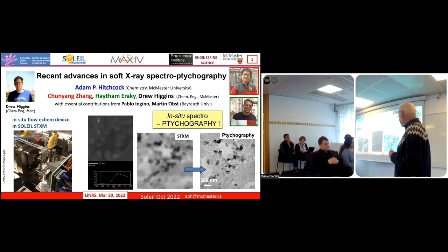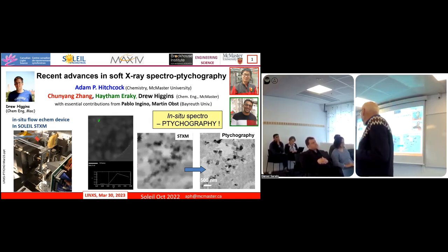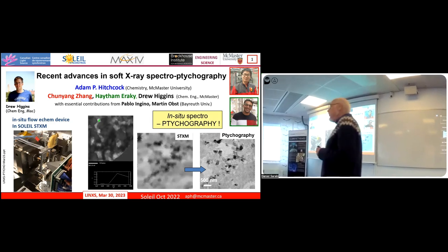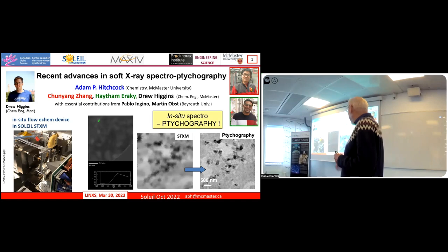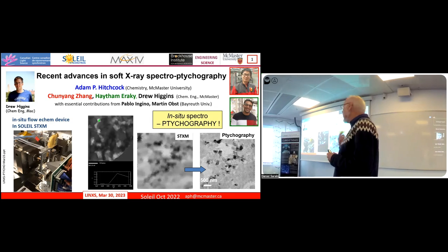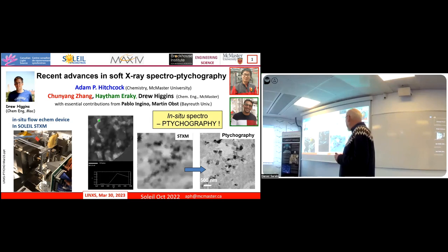So what you have in the middle is a playback of one of the type of in situ ptychographic measurements that we make. We're working at the copper L edge around 940 eV, where you can very nicely identify the oxidation states of copper. I'll talk about that more later. But what I want to show you is a set of images recorded through the edge, copper 2P edge. And those changes there can be very readily converted into maps of the oxidation state species.